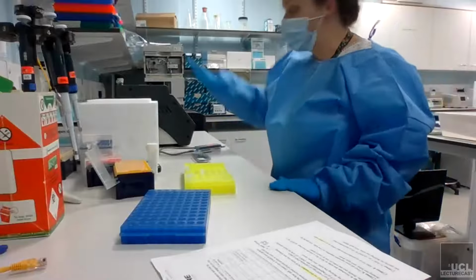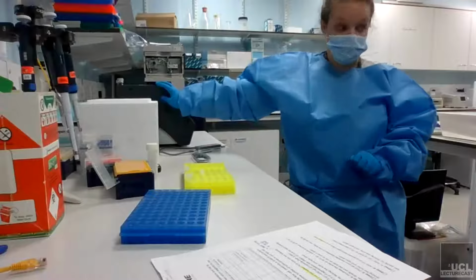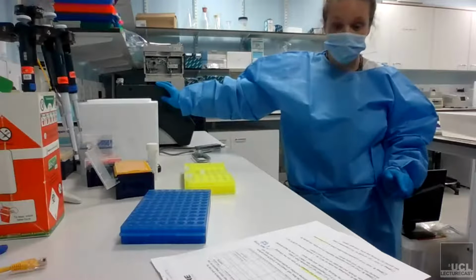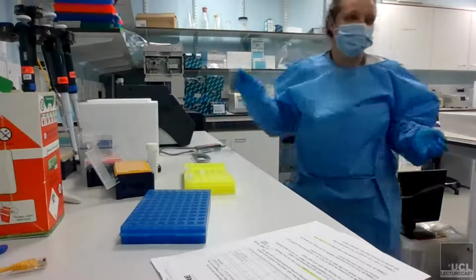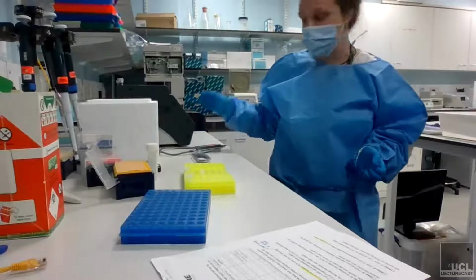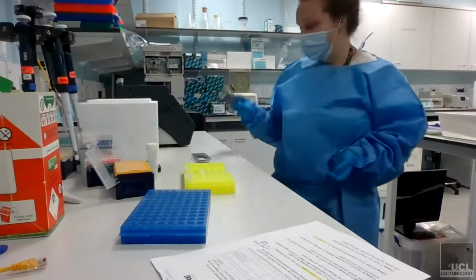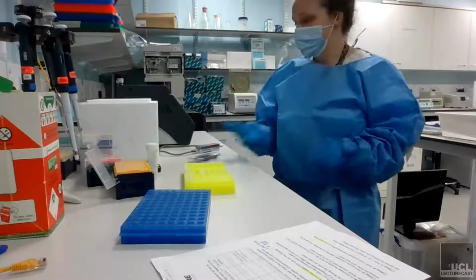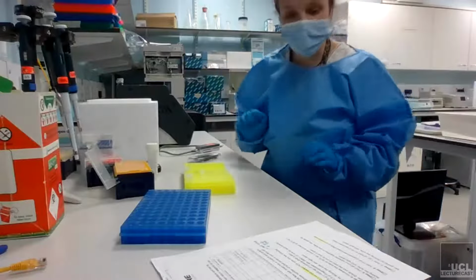You will also need a PCR machine or something that can heat your samples to 80 degrees and then 30 degrees. You could use 2 heat blocks, but it's just easier, for me anyway, to use a PCR machine because we've got one. And obviously you'll need a MinION and a flow cell. So hopefully that's everything that I've remembered, and I've prepared some pipette tips.